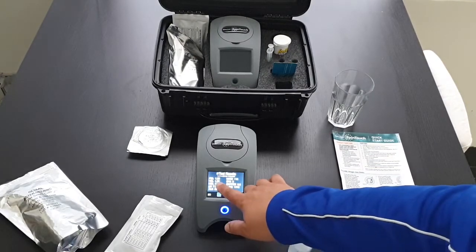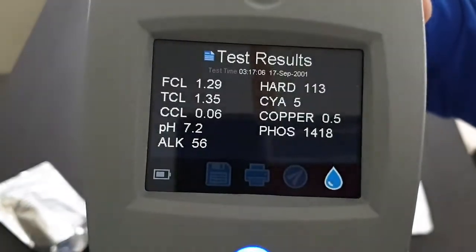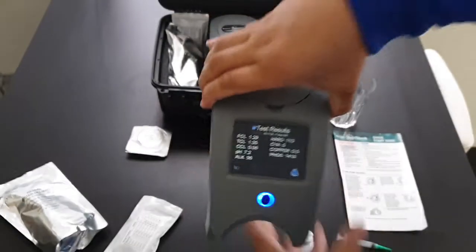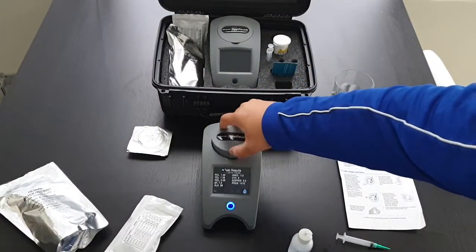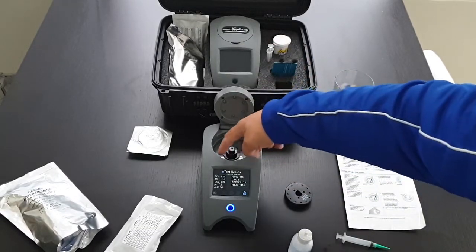So now we have our results. This is a test taken from Sydney mains water. You can see it's pretty high in chlorine and phosphates for mains water. Once you've done your test, always make sure to take the disc out because water can leak from the disc into the unit.